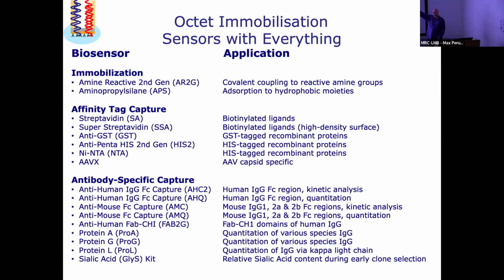And you can imagine that in pharma and biopharma, these techniques are really key, because they measure the validity of how good your antibody is and how that compares to other antibodies. So there are lots of methods for doing that kind of work.